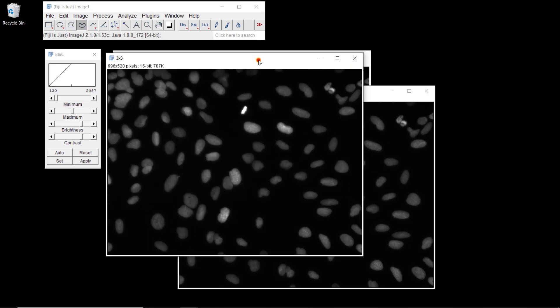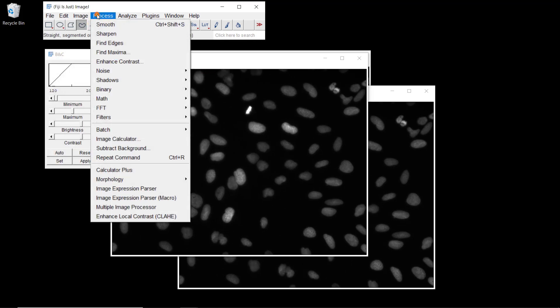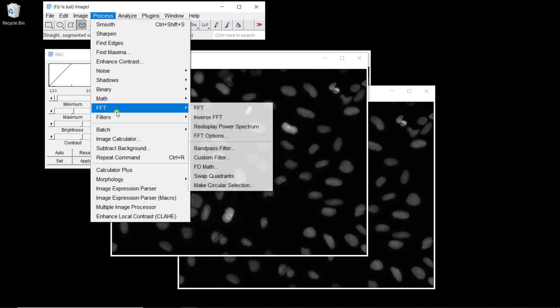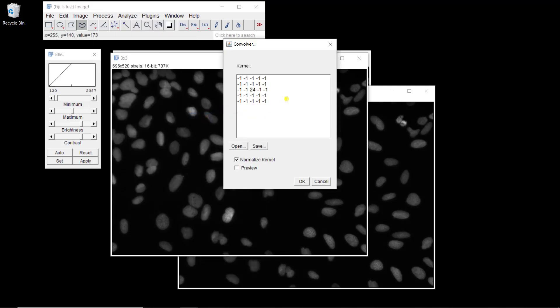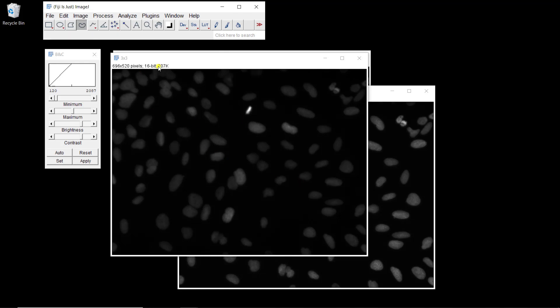Let's start with the 3 by 3 filter. To do a convolution, it's fairly easy — you go to Process > Filters > Convolve, and then you define the kernel of the convolution you want to apply. For mean filtering, it's going to be 1 everywhere in a 3 by 3 kernel. Then you just hit OK and you get your convolution.